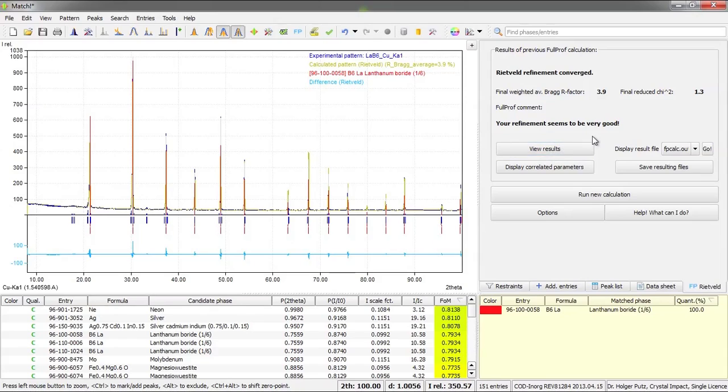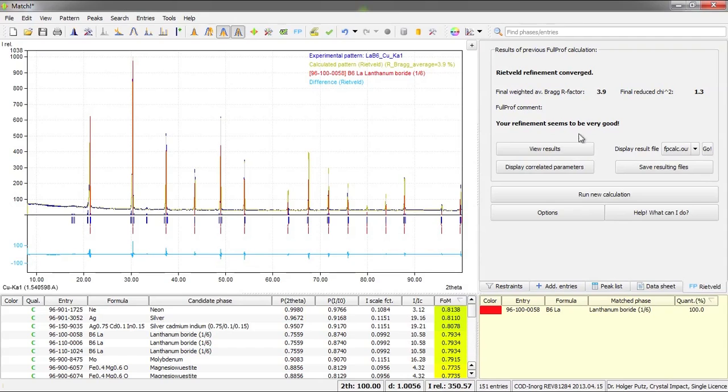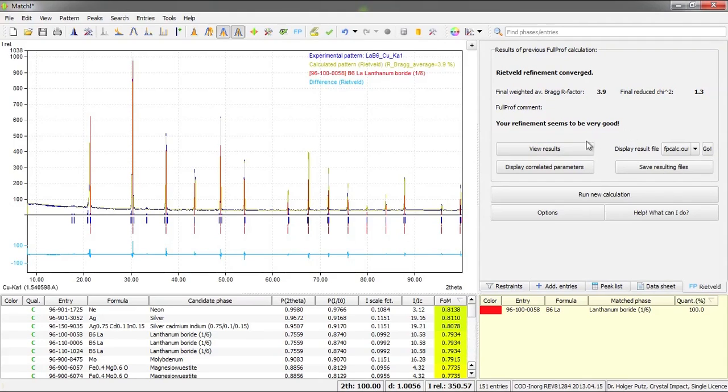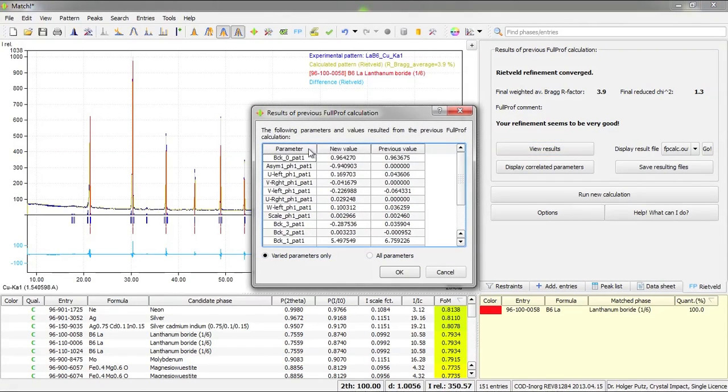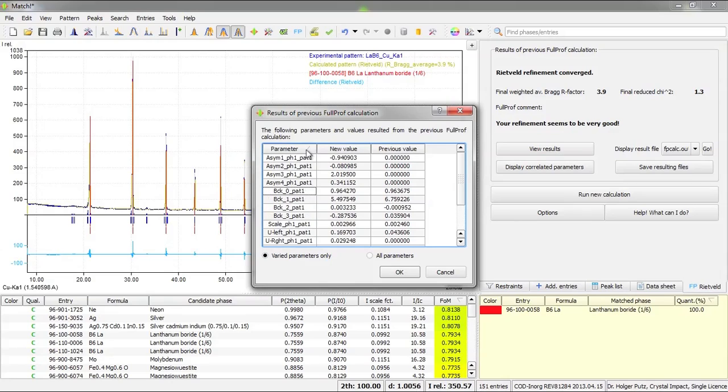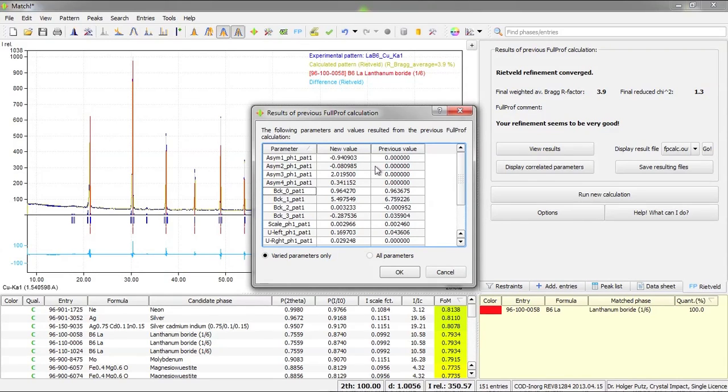Before finishing I would like to draw your attention to these buttons that are available here at the bottom of the Rietveld tab. First of all there is the button view results. Here you can get an overview over the parameters that have been varied in the last Rietveld refinement calculation, both with the previous value as well as the value that resulted from the Rietveld refinement.